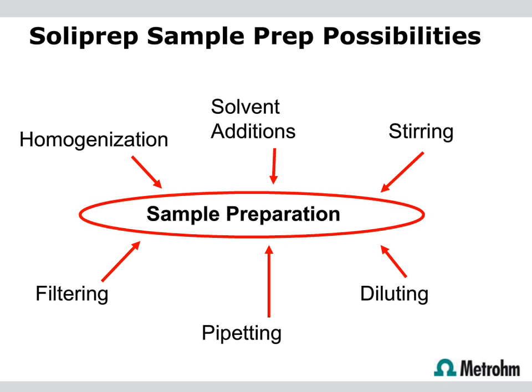Now, again, if we look at the slides, all the previous slides we talked about, all of those methodologies could be combined with this robotic sample processor, but we have filtering there, but that means we could also do things like matrix elimination. So just taking a quick closer look at a little bit of how it works.